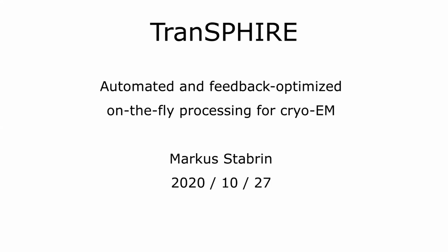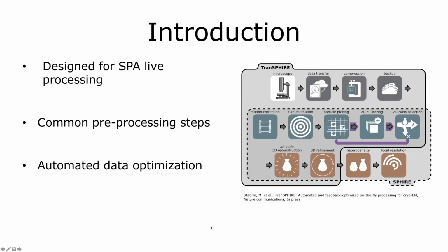Thank you very much, and thank you for offering me this opportunity to present my work. So I will present to you TranSPHIRE, an automated and feedback optimized on-the-fly processing tool for cryo-EM. And let's see if this works. So as a quick introduction, what does it do?